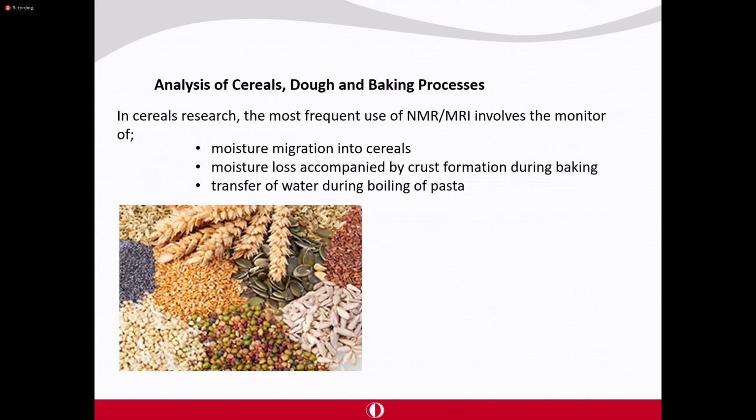Well, in cereals, the most frequent use of NMR or MRI involves moisture migration into cereals, moisture loss accompanied by crust formation during baking, or transfer of water during boiling of pasta.